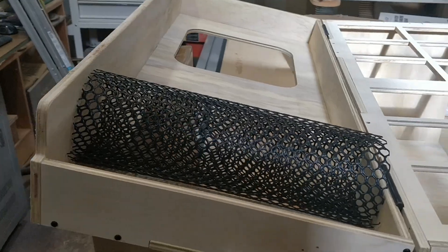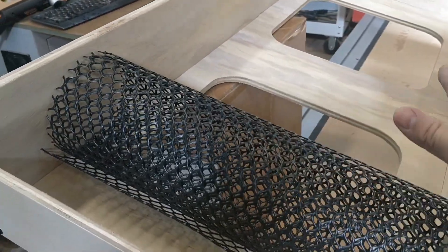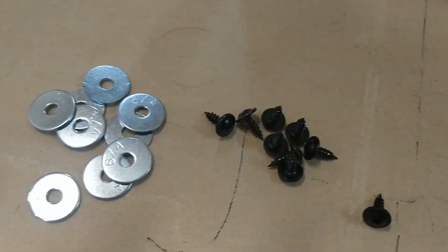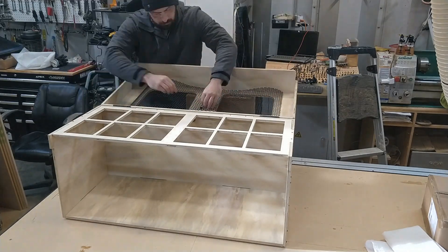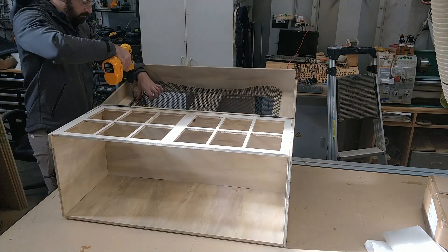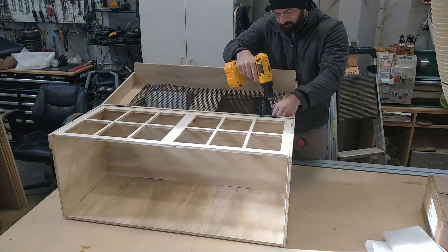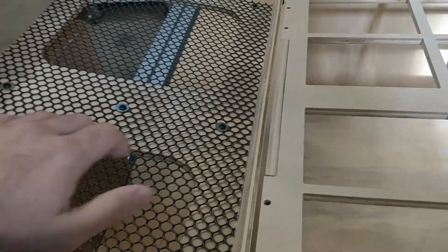Next we'll install the fan guard and the exhaust fan. To install the fan guard, prop open the lid to access the underside. Unroll it and, as you're screwing it in, stretch it out to keep it taut. You'll have three screws in a row here, three in the middle, and three at the end. The screw type is truss head number eight half-inch with fender washers. First even everything out, then install the middle row, and as you pull it tight install the side rows. There are no pre-drilled holes for the bottom so you just have to eyeball it.